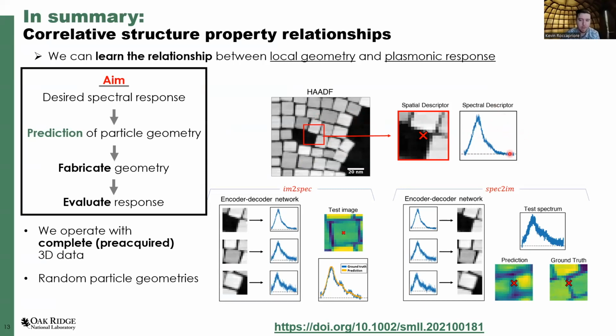The spectrum, again, could be X-ray, EELS, CL, whatever, or even probably 4D STEM or diffraction. That will work in most cases. Again, it will be for that system. It doesn't know anything about the details of the chemistry and all that, so you have to keep that in mind.